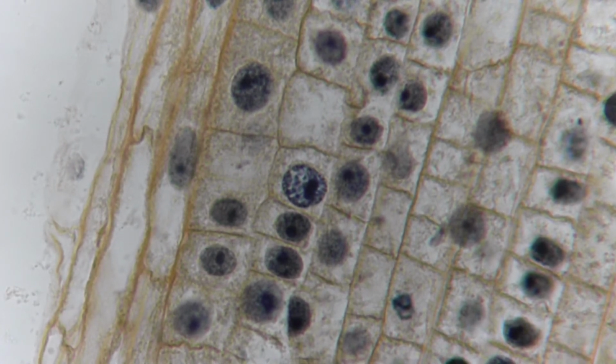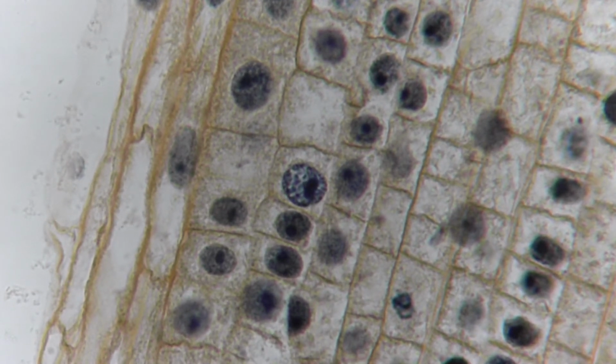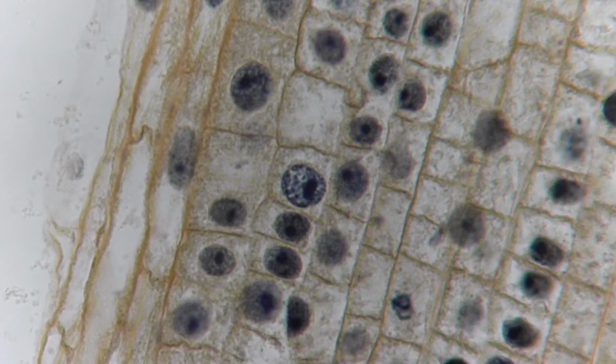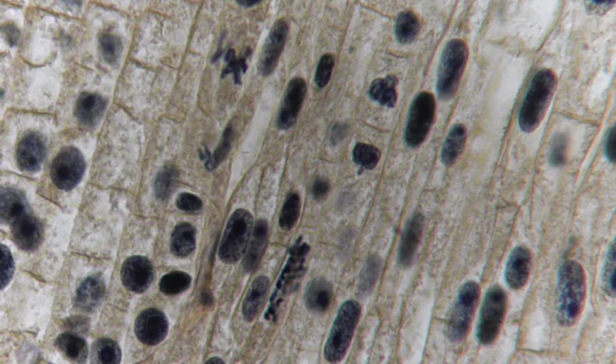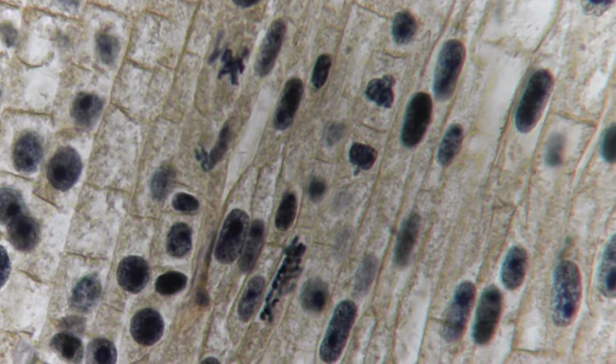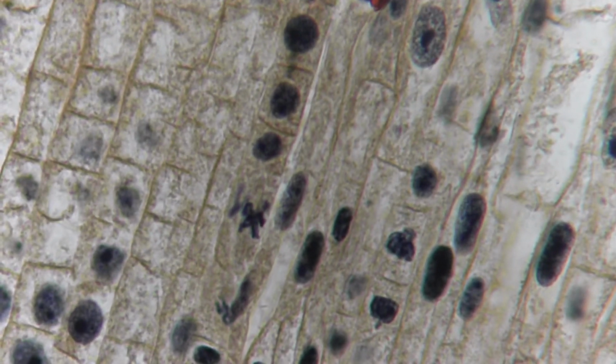I'm going to go now to metaphase, so it's interphase, prophase, and then I'm going to go over to the right and see if I can find that metaphase. Now, it's not a picture perfect one, but it's the best one I could find on this slide. Let me get it in the center here.